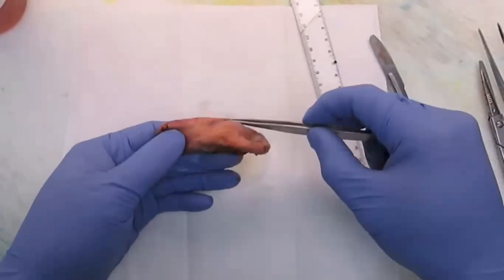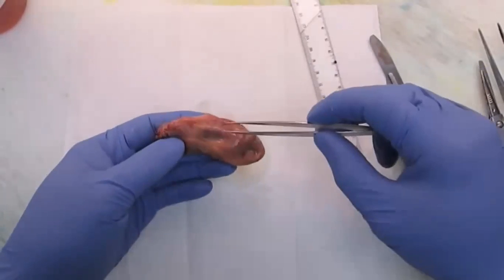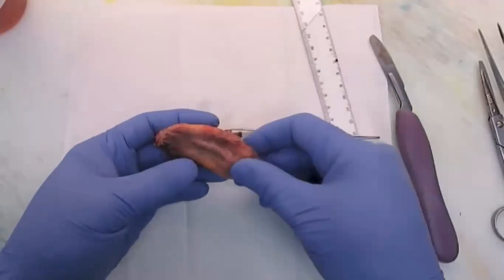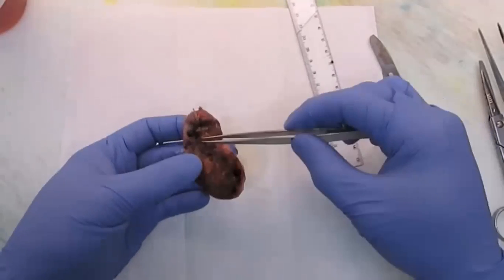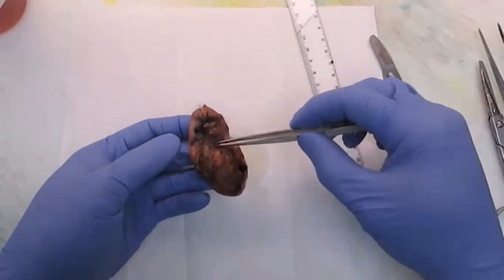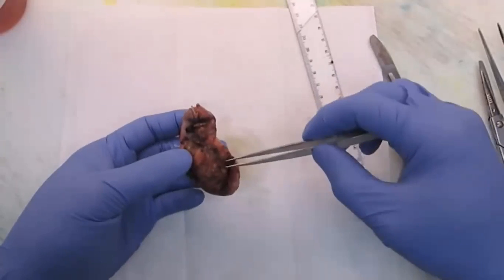Surface, and we'll just say that it's tan pink in color, and glistening, consistency. So you have to take note of that. This side is the hepatic bed, so this is where the gallbladder was attached. And normally I just say something like there's a roughened hepatic bed with cautery artifact.